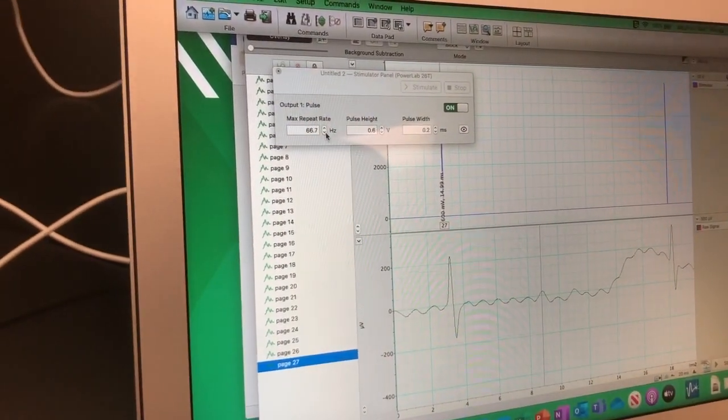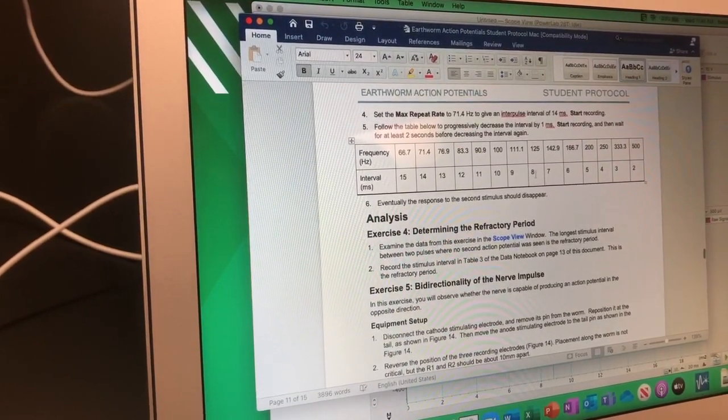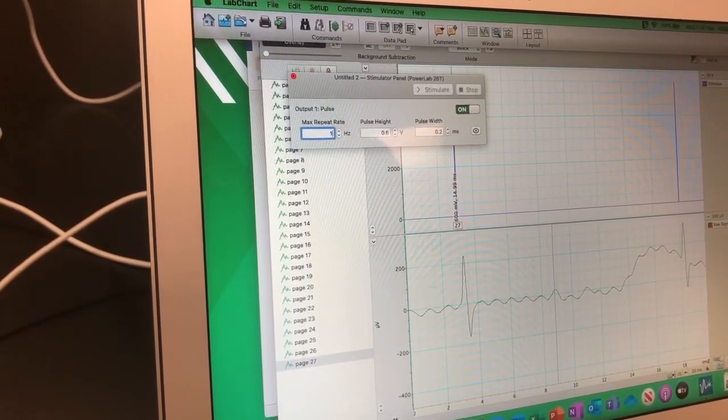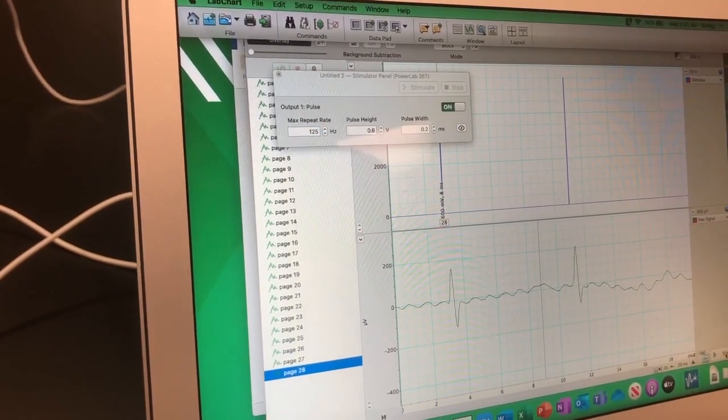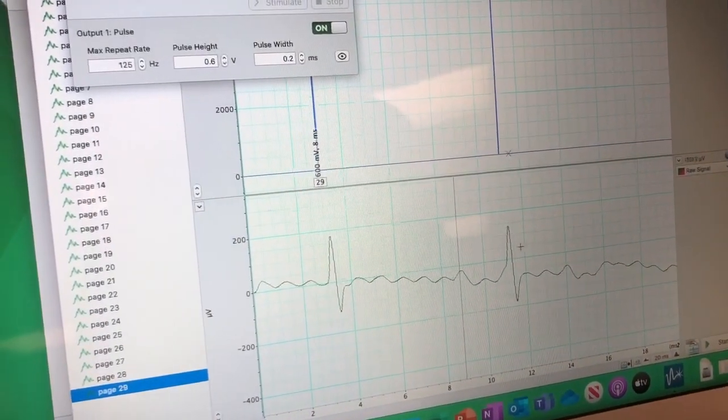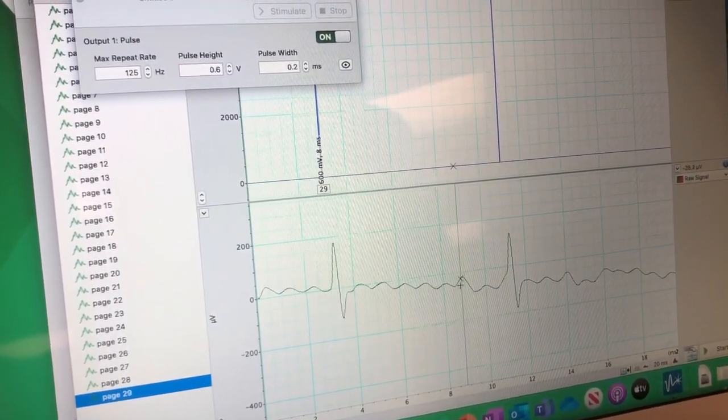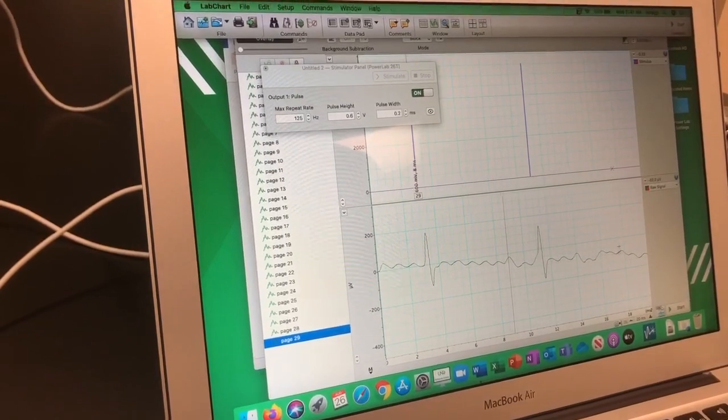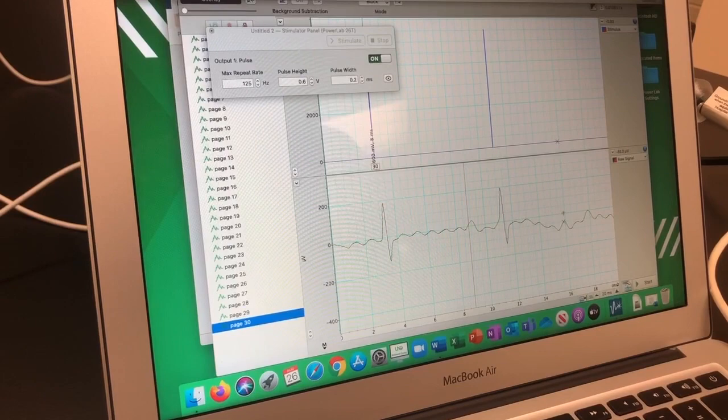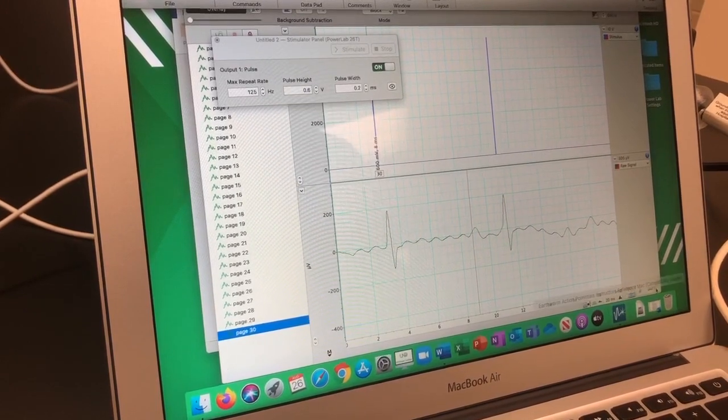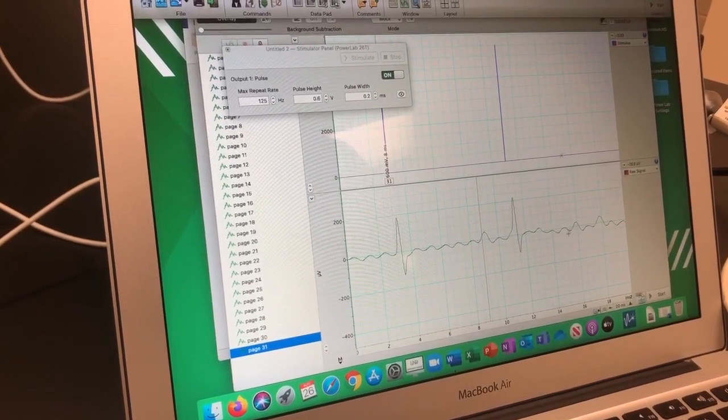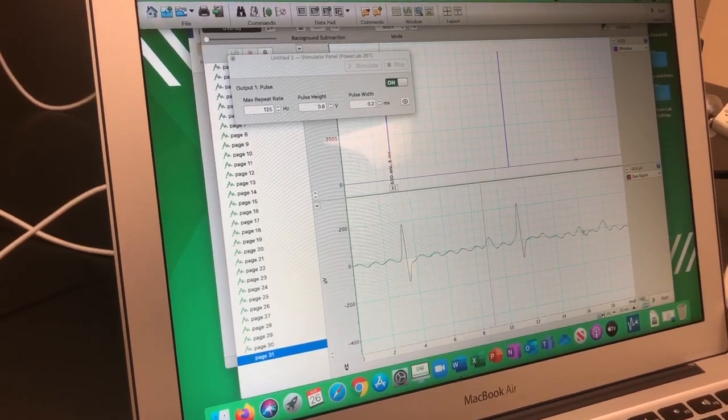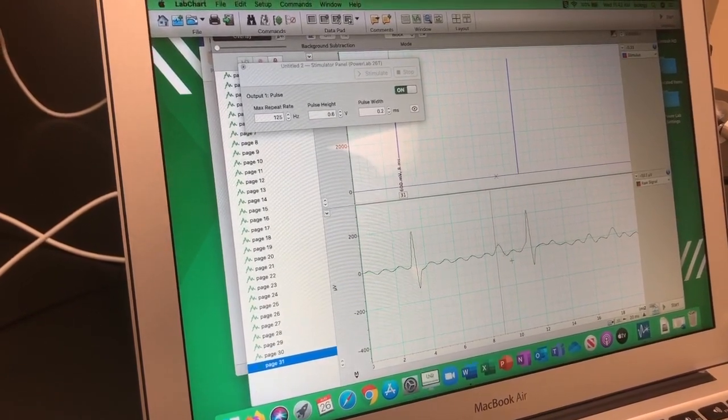Now let's go down to 8 milliseconds in between, so we change the frequency to 125 and start. We got the action potential here, the first stimulus pulse, and the action potential out here. The second action potential is here, here's the second stimulus pulse. Let's do one more to clean that up. There's the action potential right here. Here and here looks like we're recruiting the other axon running down the middle. That's why you're seeing two peaks—we've hit the refractory period on one but not on the other, so you're seeing this peak here.